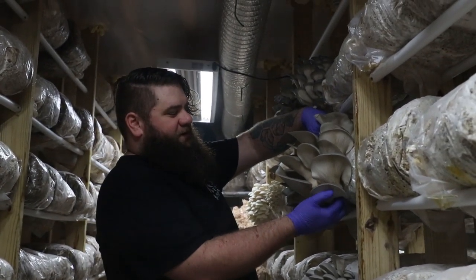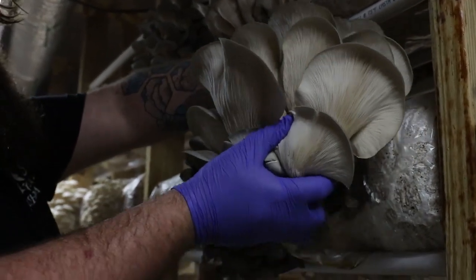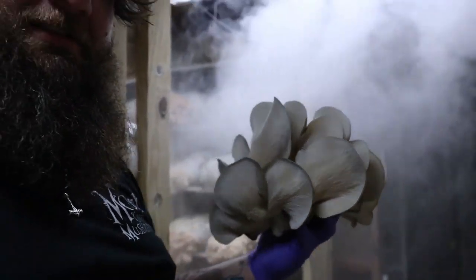When picking mushrooms, typically the bigger the stem, the easier it is to work with. So take that one right there with the nice fat stems and take it back to the lab.